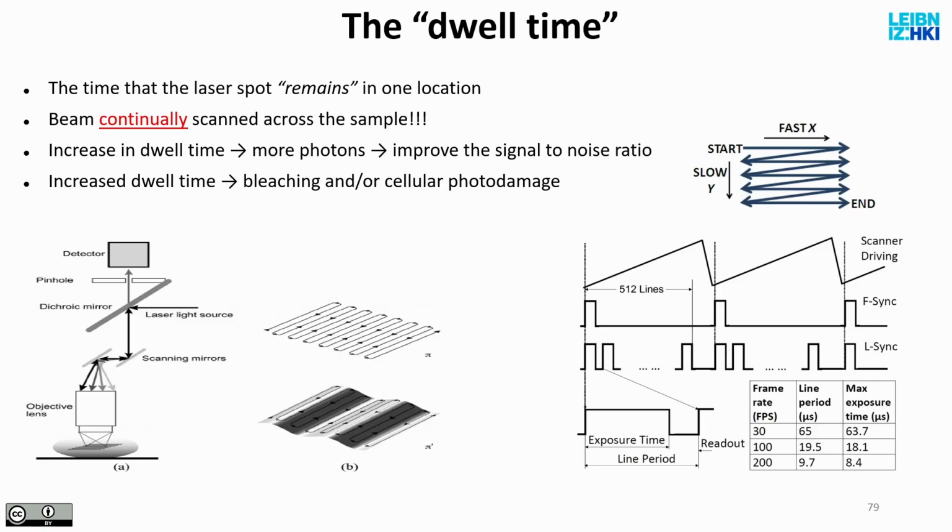We take the photons that come in and we decide for how long we integrate them. The signal is coming in, it's a noisy signal, sometimes brighter, sometimes darker, and we say, please integrate this signal for a distance that corresponds to 100 nanometers. And I call that a pixel.